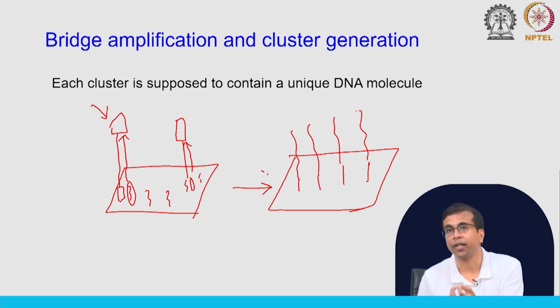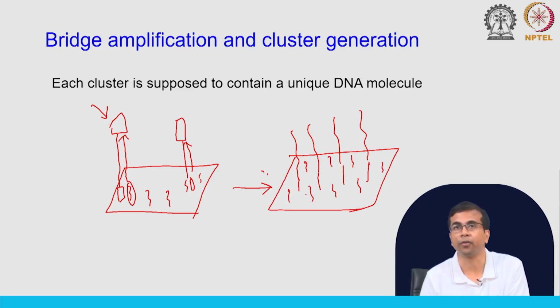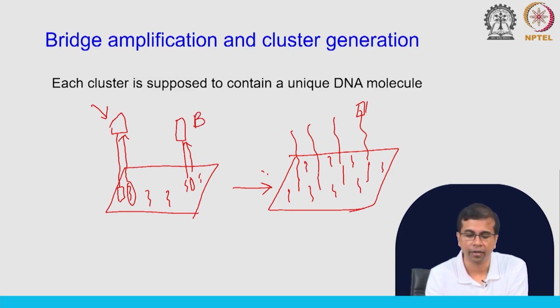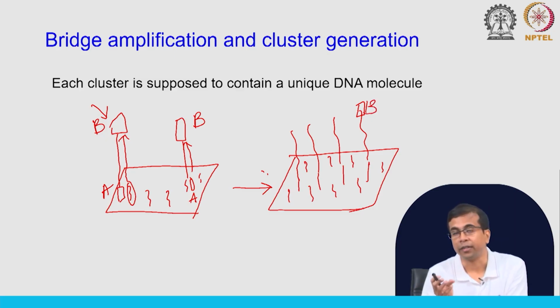Similarly, in Illumina you need to generate these clonal molecules, right, which we call clusters. Okay. So, how do you generate these clusters? We do this by a process called bridge amplification. Now, what happens? We have generated these DNA fragments on this flow cell, but surrounding that you will also have some DNA probes that will be complementary to the other part of this DNA fragment. So, remember the other part contains the other adapter, right. If you imagine this is adapter A, this is adapter B. So, the other part contains adapter B. Again we know the sequence of this adapter B.